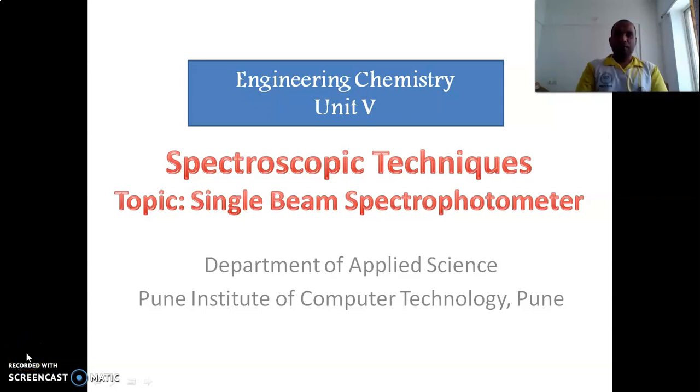Hello. Today we are going to discuss the spectroscopic technique. Spectroscopy, as we say, is a method of analysis in which the matter or the analyte is analyzed based on the interaction of the matter with the electromagnetic radiation. Now, for spectroscopy, what kind of electromagnetic radiations are used? Based on that, there are different types of spectrophotometric or spectroscopic techniques. In this topic, we are going to deal with UV visible spectrophotometry because here UV visible radiations are used to determine the analytical parameters of the analyte.